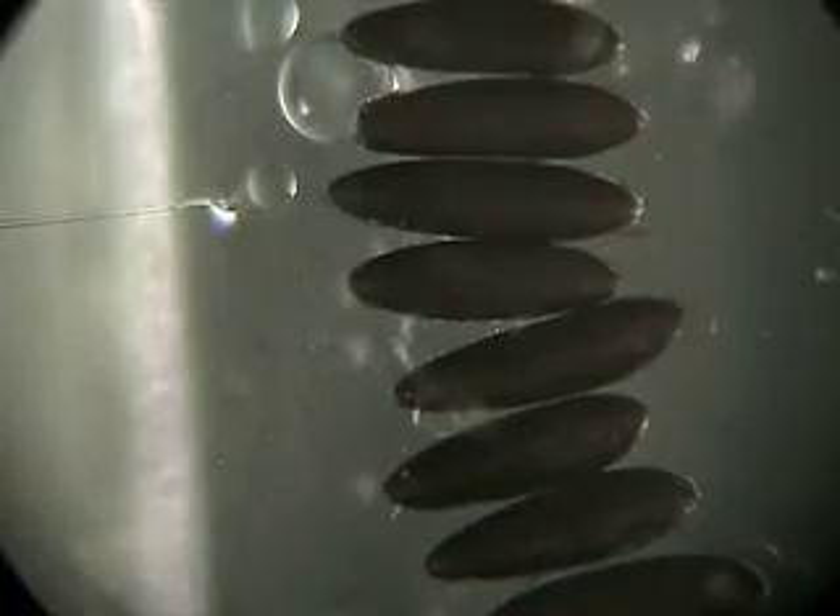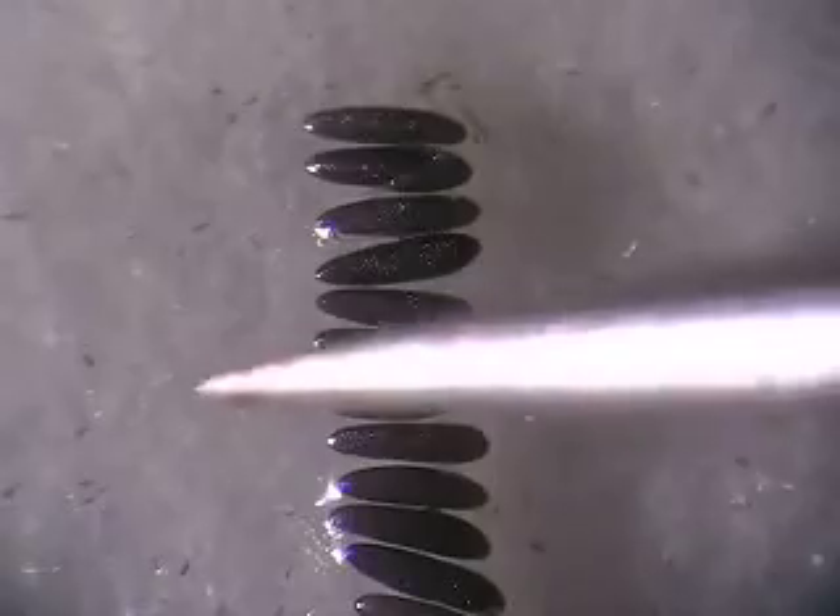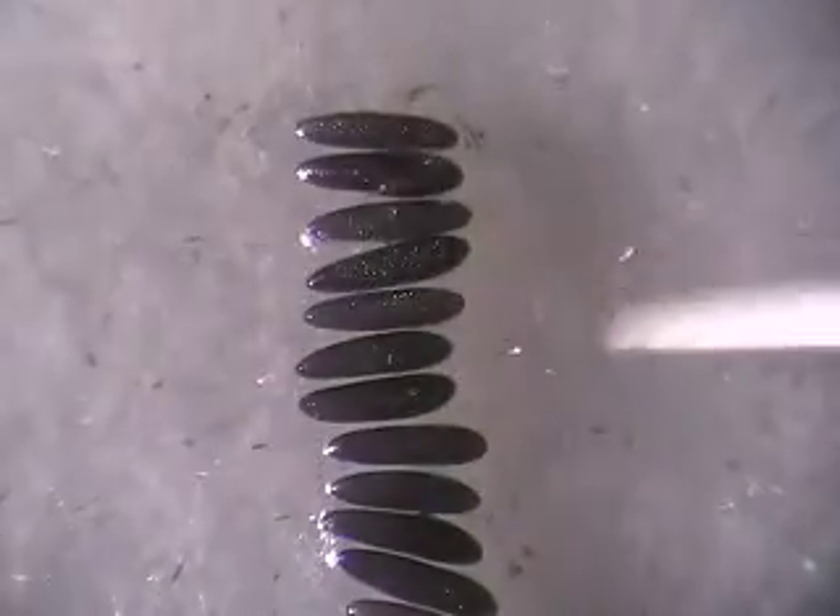I am Nijoda Yasinskiene. I am working in Anthony James lab. Today I am going to show you how to do microinjection into Aedes aegypti embryos for the purpose of getting transgenic mosquitoes.